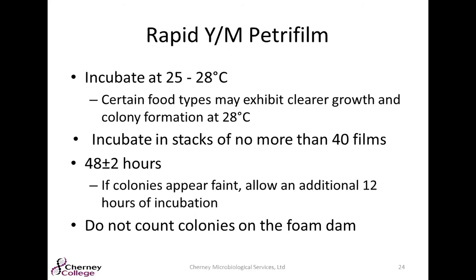However, at that time, it's noticed that colonies can sometimes appear very faint. So it's recommended that you allow an additional 12 hours of incubation just to really allow those to develop and make sure that your count is going to be accurate. And then again, make sure that you're not counting colonies that are on that foam dam that aren't exposed to those nutrients on that plating surface.